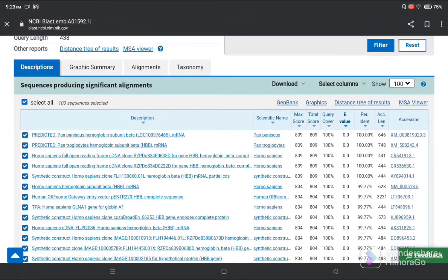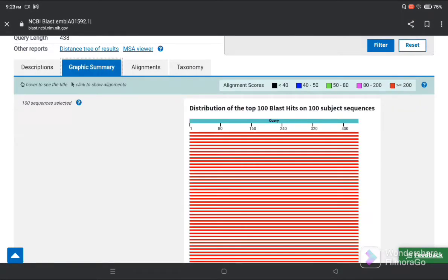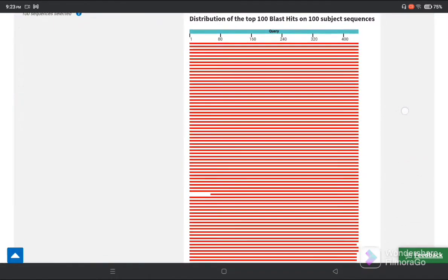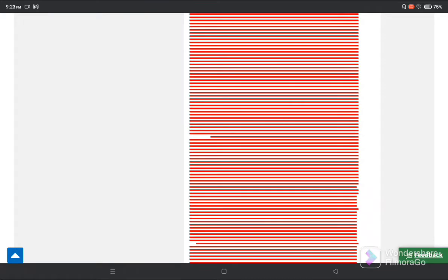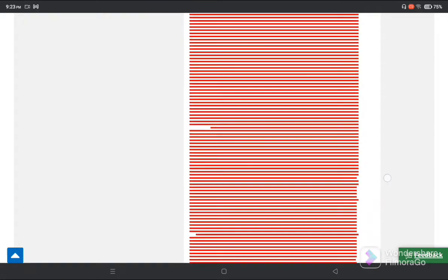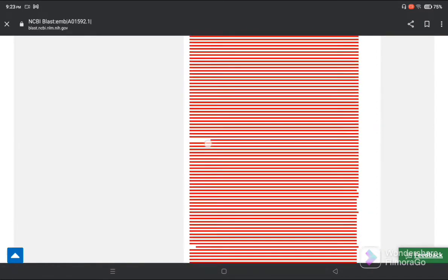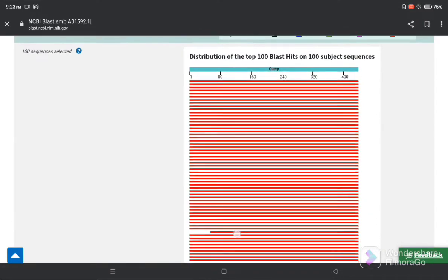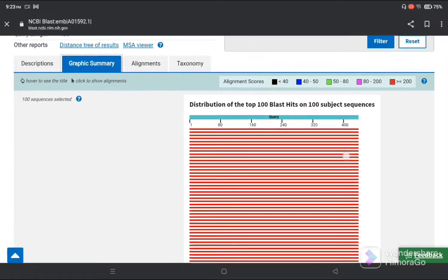This is our description. Next we go to graphic summary. As our sequence is similar, you can see the red color lines showing very similar. Only small gaps are present, but you can see almost a very similar sequence.